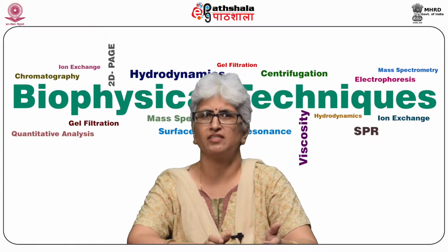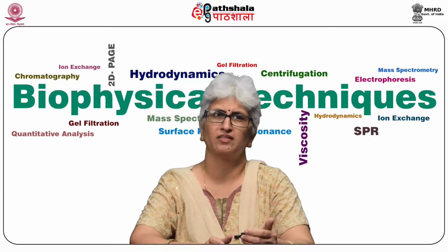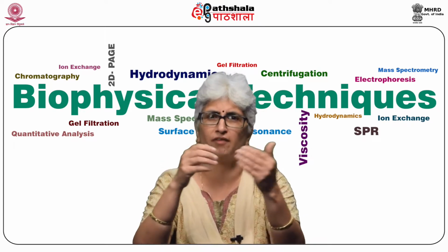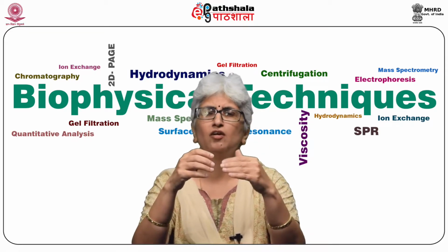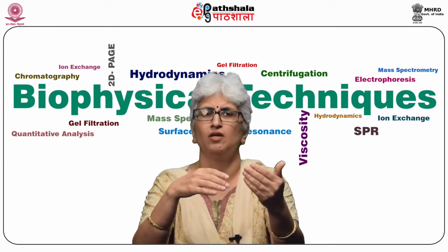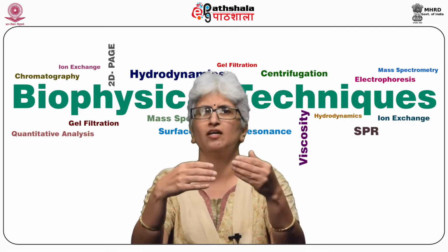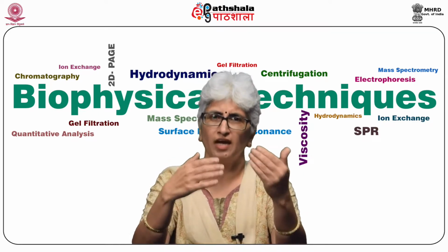There are many factors that affect the separation quality in affinity chromatography, but the most important factors are selection of affinity ligand, buffer systems, and sample preparation. Now, how will selection of affinity ligand affect your purification? Suppose you have taken a ligand which has affinity not only towards the target molecule, but also towards some other molecule. Then what you want to purify with this ligand, you will not be able to achieve using a non-specific ligand. So the ligand should be very specific for the target molecule.